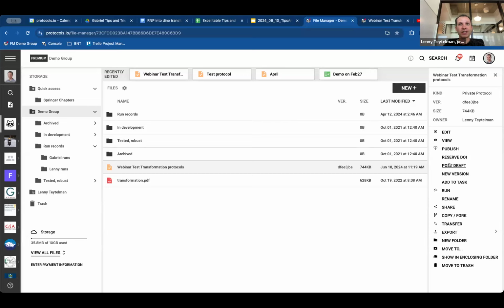So most of these are self-explanatory. We have good information on that. What I do want to say is, if you're not ready to make it public, use the share button. Of course, in a workspace, you can invite collaborators into the workspace, but there are situations where you want to share with someone who is not part of your research team.